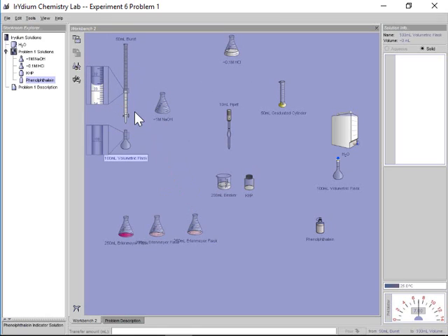What I want to do is, let's say, 10 milliliters of my NaOH. And once I add water up to the mark, 90 milliliters, then it's going to be diluted by a factor of 10. Because I want to dilute a little bit less than a 1 to 10 ratio, maybe I'll transfer in 9 milliliters. And again, the burette is really nice for reading this. I can take my starting reading. In this case, I'm just going to type in my transfer bar.